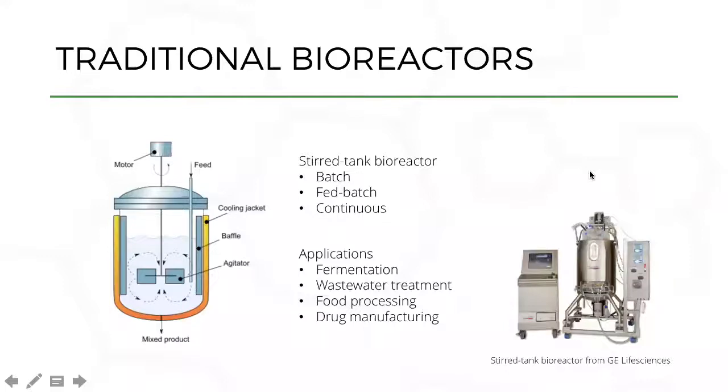Okay, so let's start by looking at bioreactors in general. When we mention the word bioreactor, for most of us what probably comes to mind is the classic stirred tank bioreactor that you see in a lot of manufacturing facilities, right? There are different modes of operating a traditional stirred tank bioreactor. It could be a batch mode, a fed batch, or a continuous mode where you have continuous perfusion going in and out of the system.